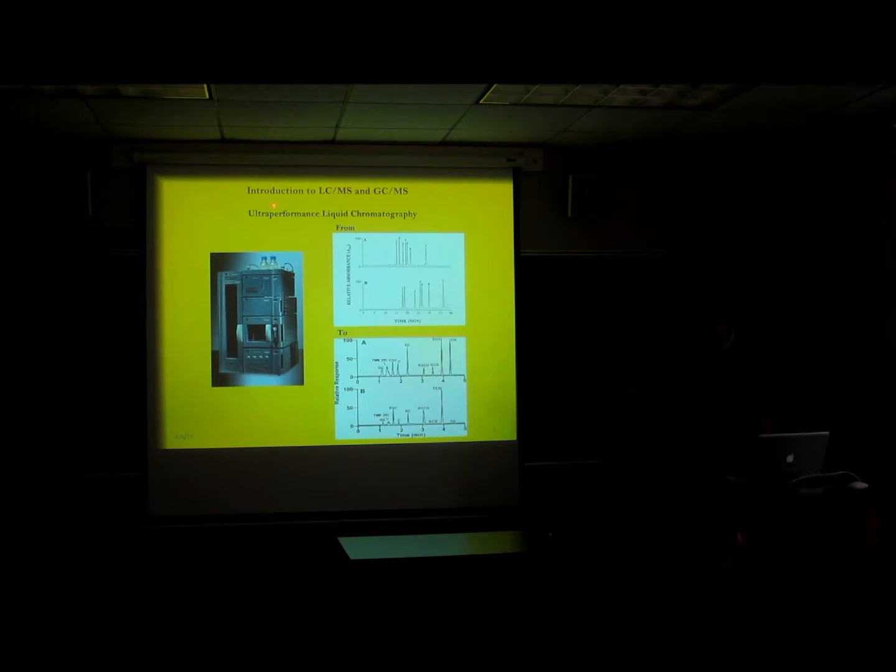One thing I do want to mention in terms of liquid chromatography is the advent of ultra-performance liquid chromatography in the past 4 or 5 years. This is basically an engineering development where there are now commercially available liquid chromatographs that have been engineered to withstand back pressures of 12 to 14,000 psi, compared to 5 or 6,000 psi for a standard liquid chromatograph.